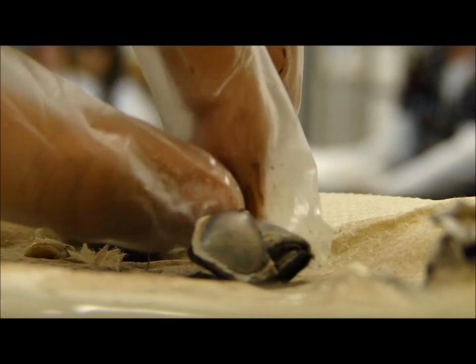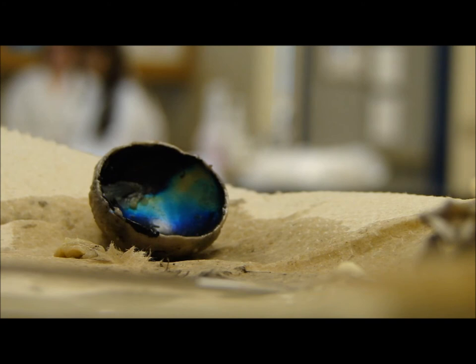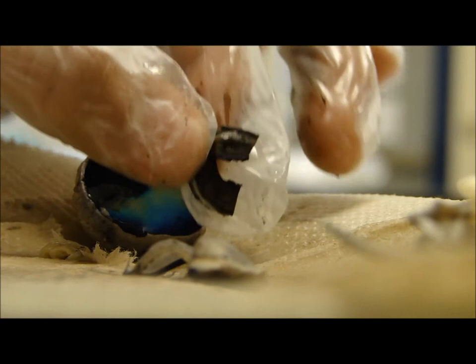Now it says insert the forceps through the opening created and carefully separate the edge of the iris from the inner surface of the eye. You may be able to remove the iris intact. Pick up the back half of the eyeball and observe the structures on the inside. Identify the retina.